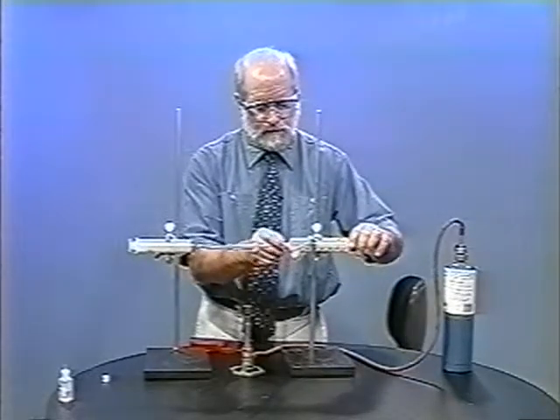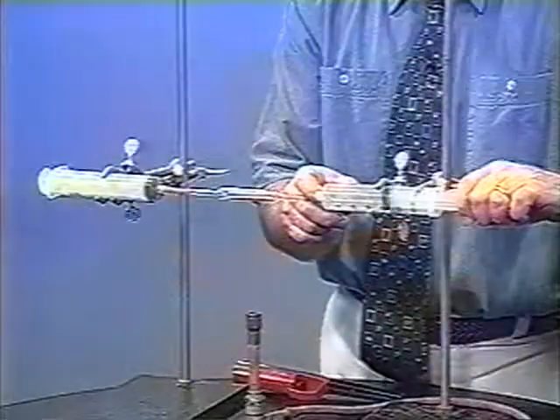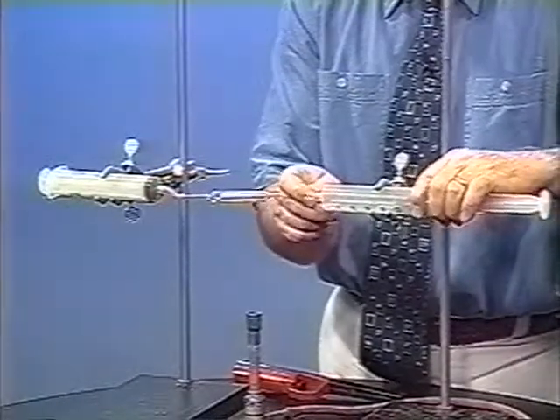So I'm simply going to open this up and pull air into this syringe, and then connect it back up.